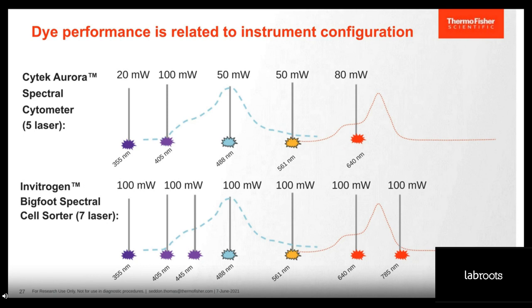One of the things that we have, depending on which instrument you use, is something like the Nova Blue 660, the original 40S version. There are places where it actually can look brighter in the red. And again, that varies from instrument to instrument because there's this better detection in the red off of the APDs on the Aurora specifically as compared to other instruments.